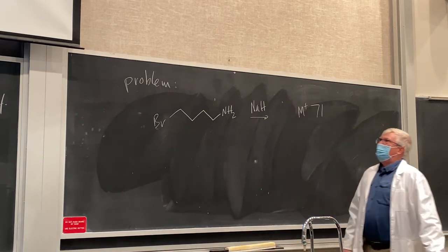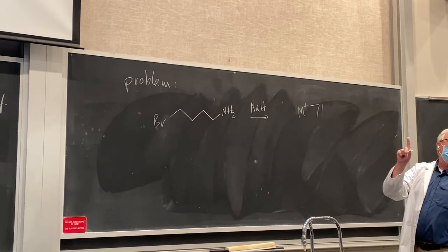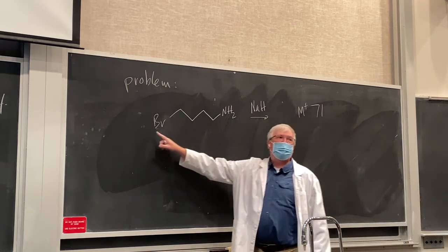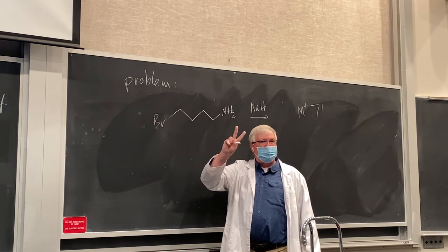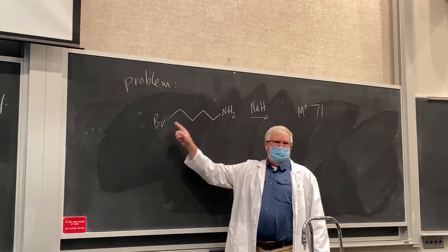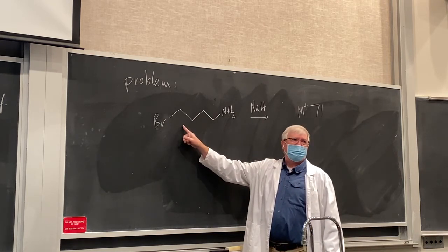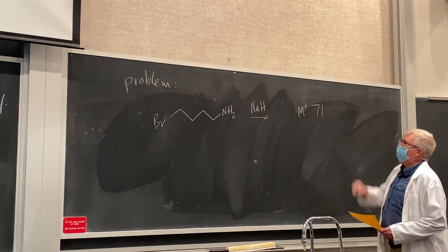And you're tempted in the mass spec to say, well, we've got 2 peaks up there, but they're not 1 apart from each other. Remember the halogens, it's the M+2 rule for those isotopes, right? The chlorine is 35 and 37. They're 2 mass units apart. Same with bromine, 79, 81. So the product here is lower mass than the starting material. So some things are going to go on here to get to 71.